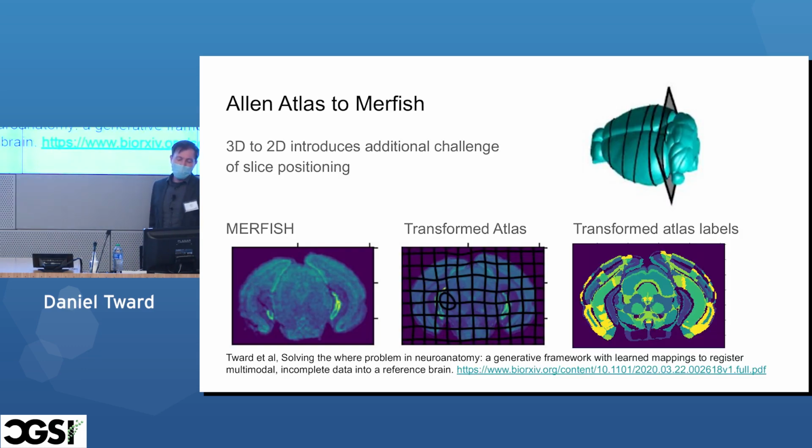So the third situation we're applying this alignment tool is to align our 2D coronal cross-section data sets into a 3D atlas so that we could use all of the labeling that was constructed in the first page to see if there really is an assortment of cell types into the regions which were invented by anatomists. So the partitions that I showed you on the second slide, there is not a good sense that the brain knows it's supposed to be partitioned in that way. Those were invented because they were convenient or because there was a particular type of signal that someone was looking at such that they thought there was a partition.